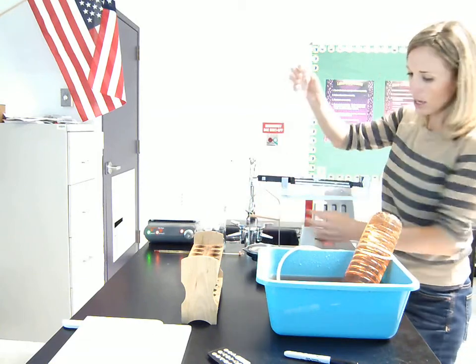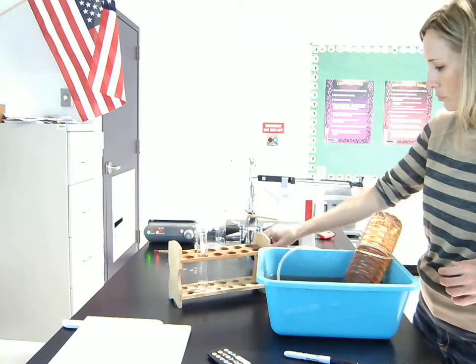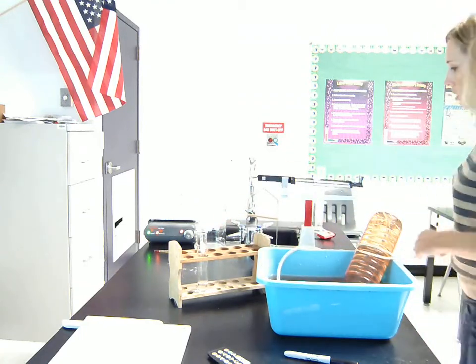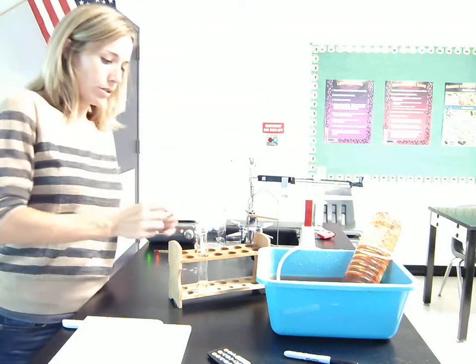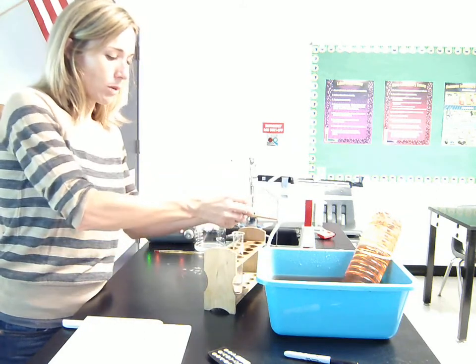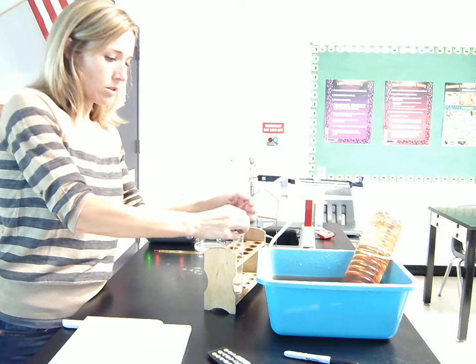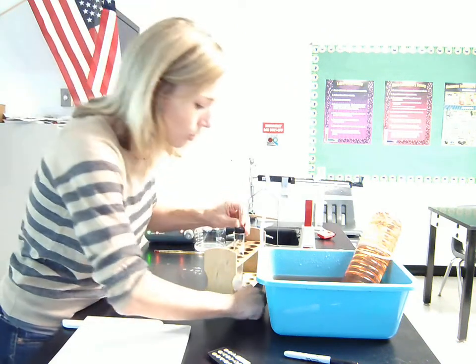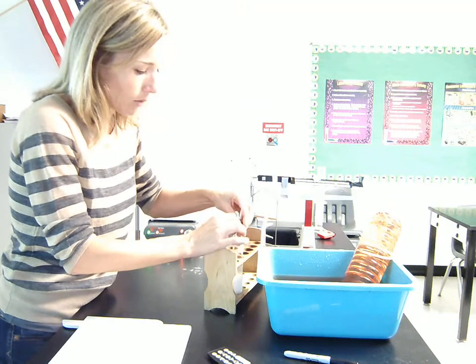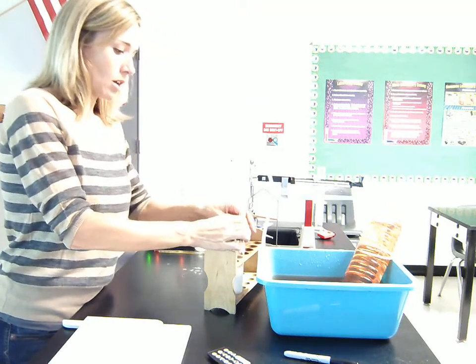So, having said that, we're ready to actually get this thing going. So I've got my test tube. I'm going to have to, let me walk around over here. I'm going to have to break this Alka-Seltzer in half because it won't fit into the test tube when it's full. But I've got to be ready so that as soon as I drop it in the water, I stop it immediately. And, oh shoot, I dropped a piece. That's going to mess it up. Well, if our results are off, we'll know why. Hopefully it won't be too far off.